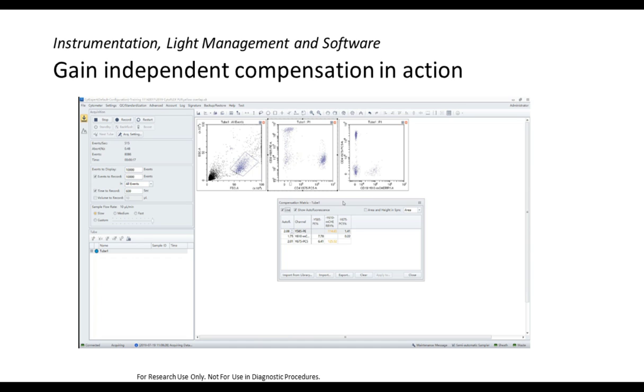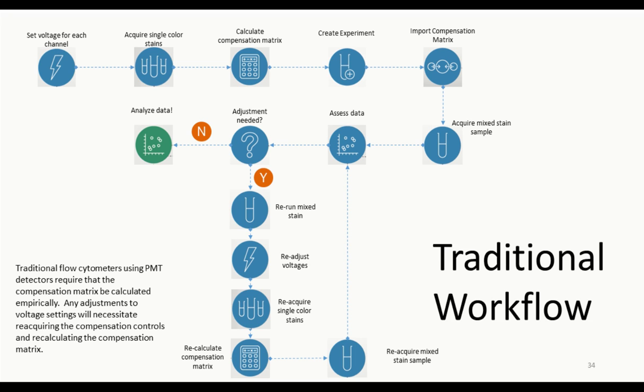And so that is a powerful tool within the software that I'd like to next demonstrate the utility of by reviewing with you the workflows for compensation. My intention in showing this video was to demonstrate the gain-independent compensation in action. And now let's look at how that translates into the workflow for generating a compensation matrix.